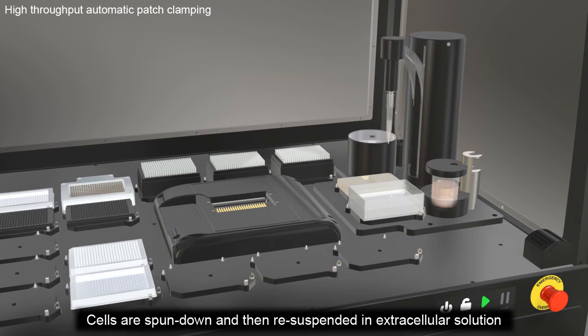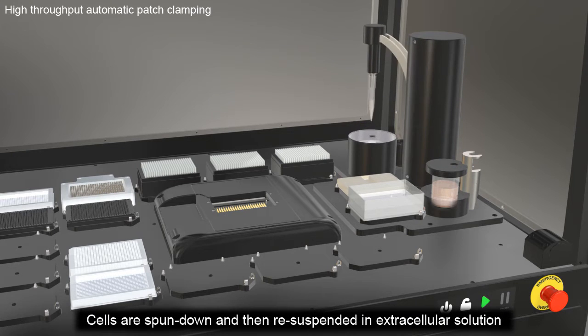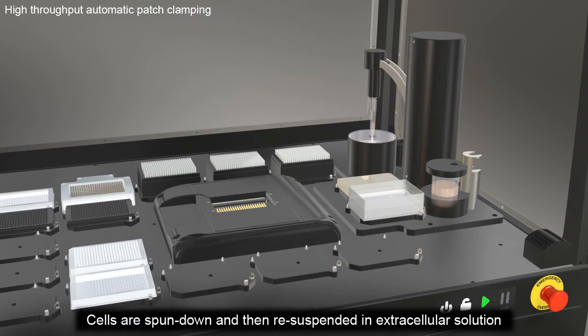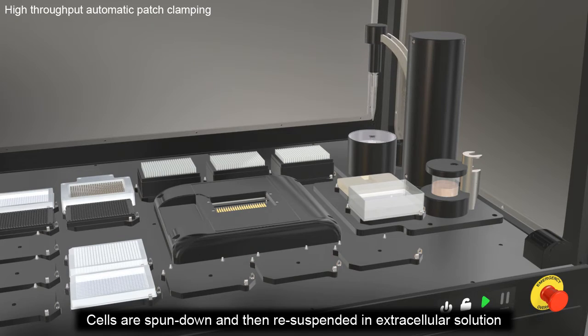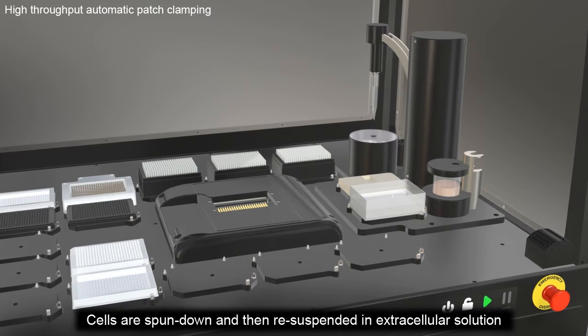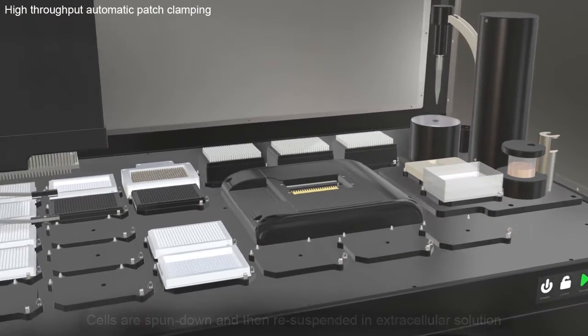Cells are transferred to the onboard centrifuge, the Q-Fuge, where they are spun down and re-suspended in extracellular solution.